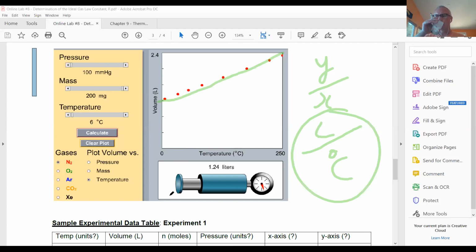The points on the graph. The numbers, the real numbers. Yeah, but these are numbers. I got a line, I got numbers. How am I going to know I've got the right numbers and the right slope? Is it the endpoint will fit into should equal the difference in the slope? The value of R is close to 1. Oh, R squared. You mean R squared? That tells us how close the points are to the line?